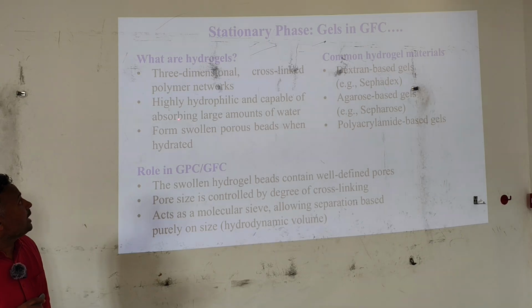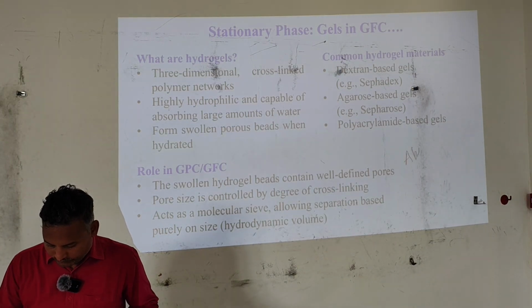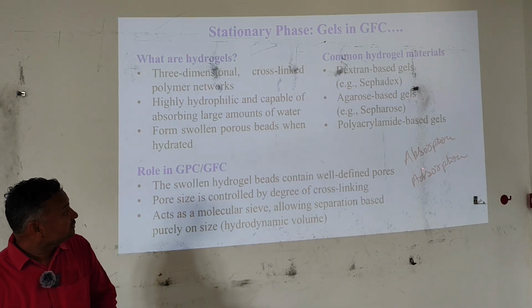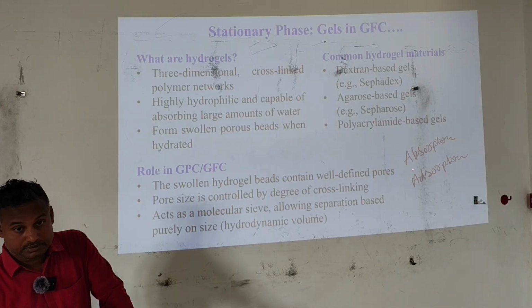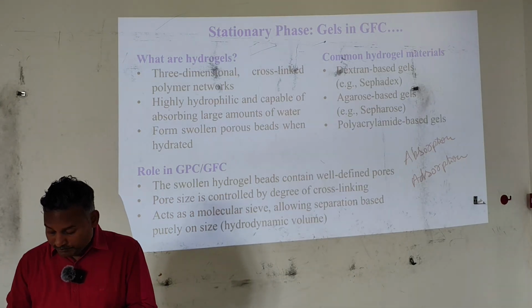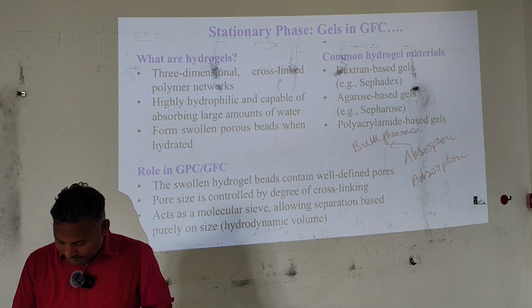Capable of absorbing. I think you know the concept of absorption. Adsorption, with an AD. Don't get confused. Absorption is a bulk phenomenon.